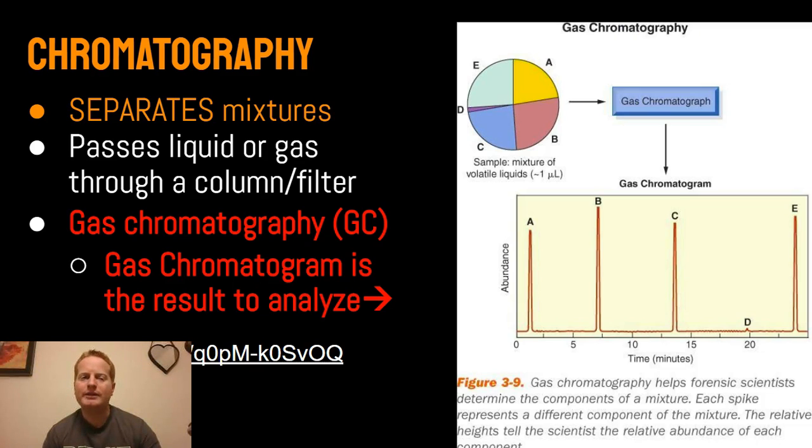So how does this work exactly? Chromatography in general is a separation technique. In other words, it's kind of like filtration, only in this case we're just doing it with gases, so it's kind of like a Brita for gases.